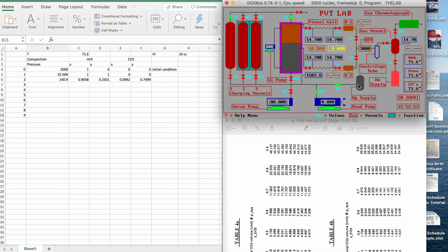Okay. Now I'm going to close valve 10. I'm going to close the valve to mercury supply and I'm going to open valve 8 again. So I removed the 30. So what I need is 16.137. So I'm going to do 16.13 first.